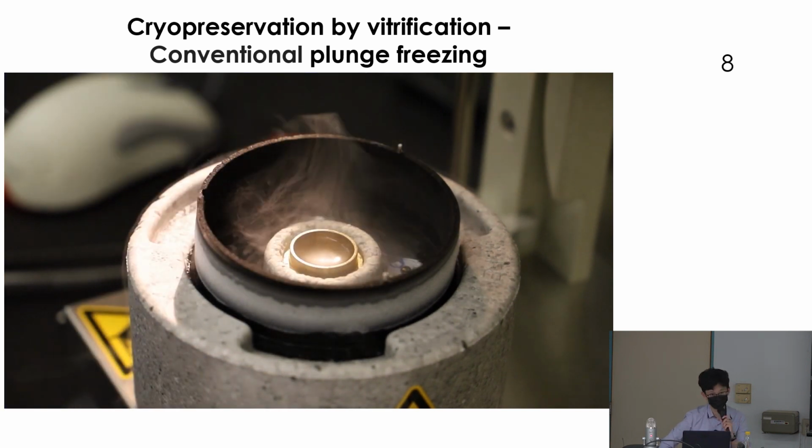So you can see the whole process. Well, it's okay, but it really depends on whether you are handy or not. It will take a few minutes. Even the quickest still needs a few minutes to finish one grid. So you won't be able to deal with millisecond reactions if you really want to do a time-resolved experiment. So later on, next hour, we'll have a new device talking about a new way to freeze your sample.